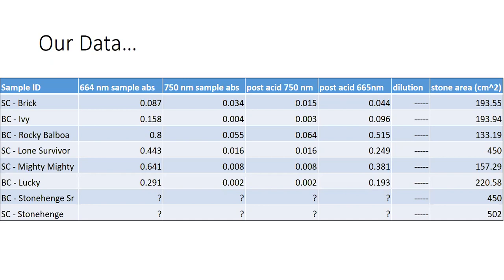So just a reminder of what we've done up to now. We brushed all the chlorophyll off of the rock into those little brown Nalgene bottles. We then brought those back to the lab and filtered them onto multiple filter papers for each sample. And then those filter papers went in the freezer. That lyses the cells and makes it easier for the chlorophyll to be extracted.